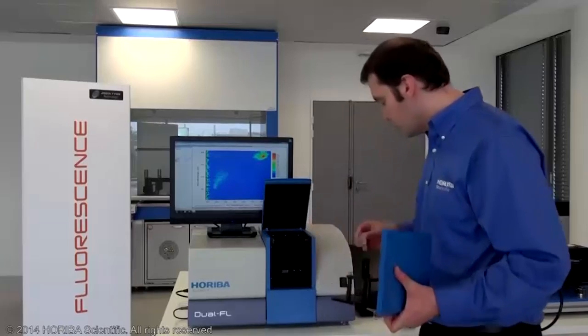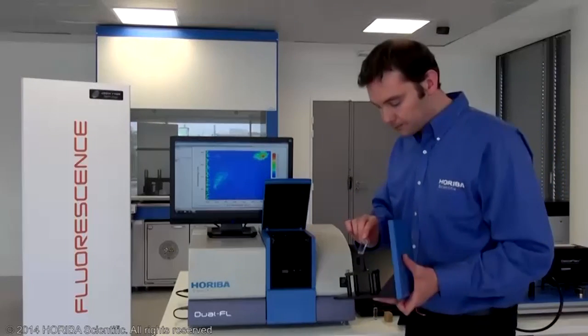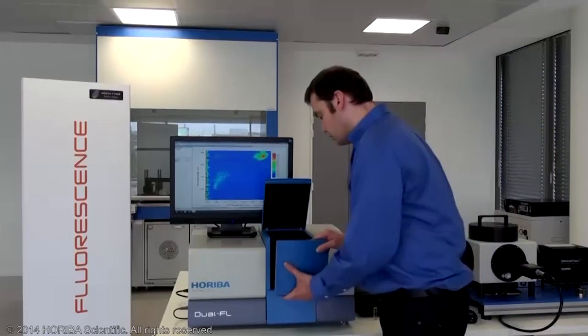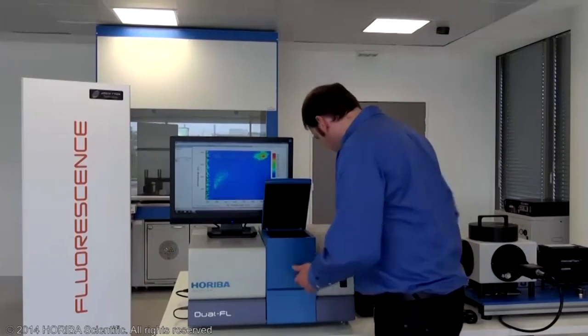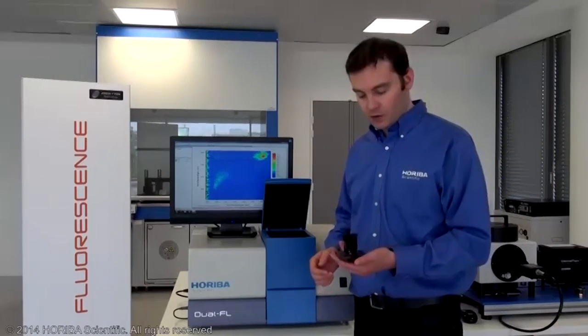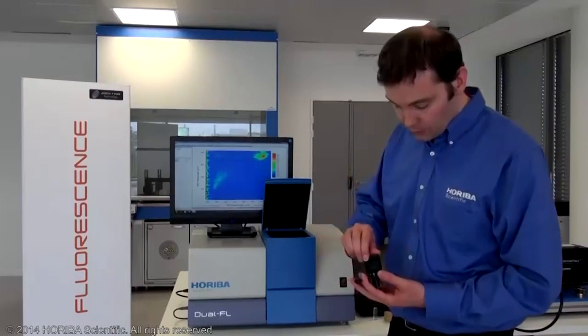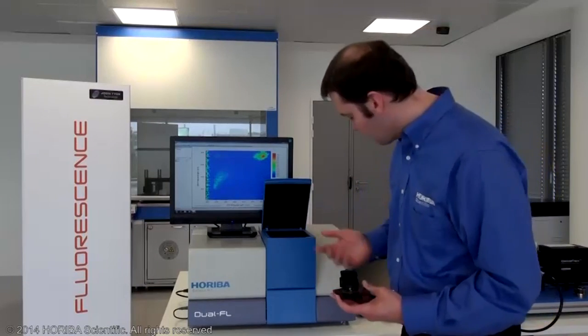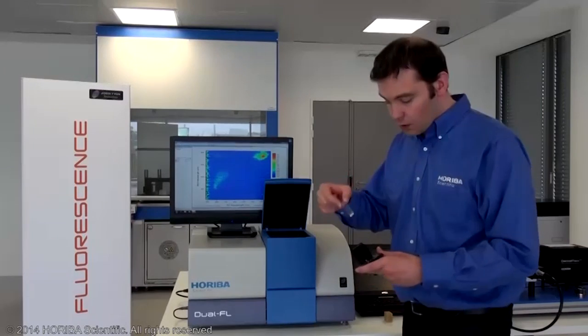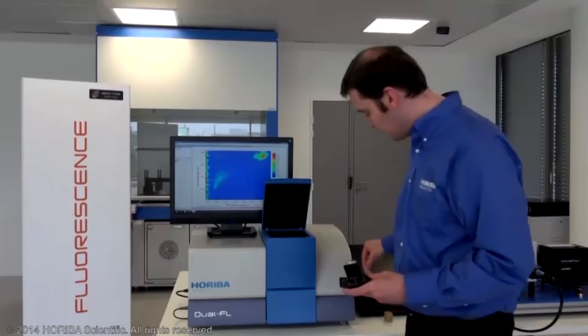Okay? So with this holder you can have liquid again, but due to our history in spectroscopy, you can also work with a solid sample holder like this one, with a specific angle. With this you can work with any type of sample. It can be a cuvette as well, or something with a liquid inside.